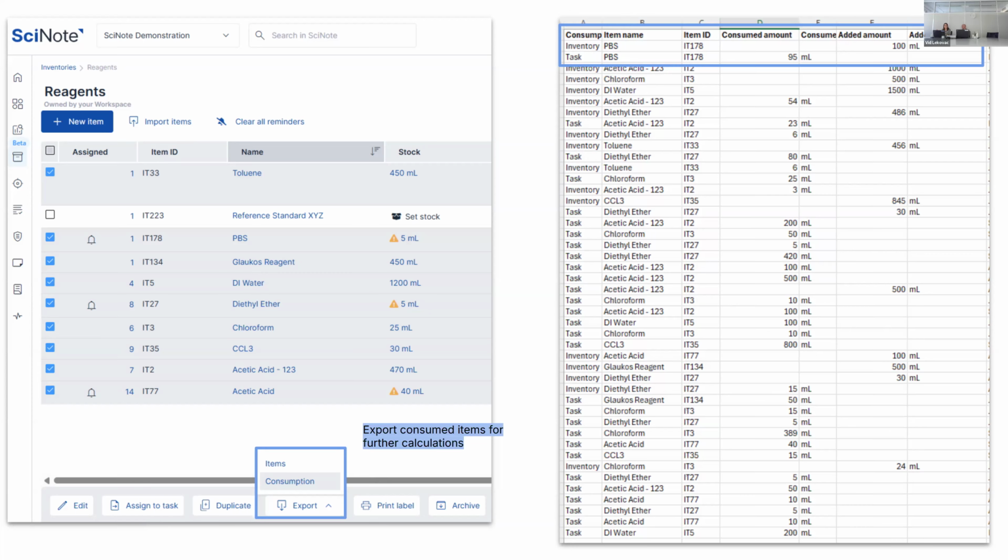What this allows you to do, if you're manufacturing any internal buffers, reagents, or doing anything internally, it could also be, let's say you're a medical devices company and you're manufacturing some devices, you can have these items created as an output directly in the inventories from the ELN part. So this becomes important also. Let's say you're doing aliquots or anything else. You have an output, you can create those, and you're going to create those records in the inventories.